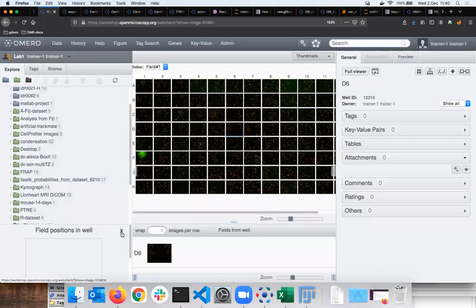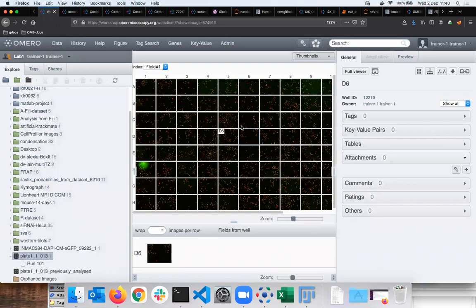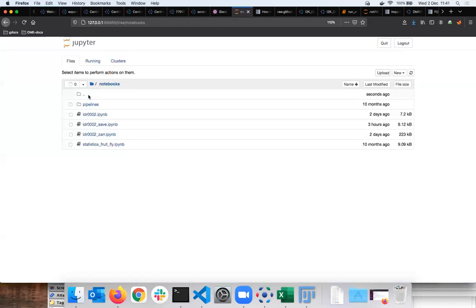These data will be analyzed. We will segment the cells on the first time point in the time lapse only to spare time. I have built a similar environment. This is now basically exactly the same logic as with Fiji.